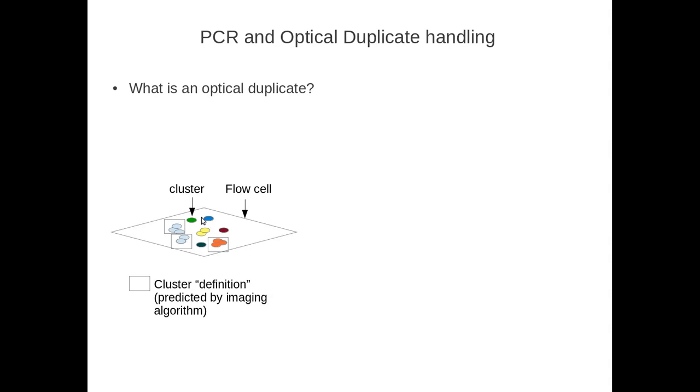If we wanted to flesh out the figure, the boxes should be around one color, but here we have two boxes around the same color. And so what that could do is this can artificially be interpreted as different genomic fragments when in fact they are coming from the same fragment, and this can lead to similar problems to the PCR duplicate problem.